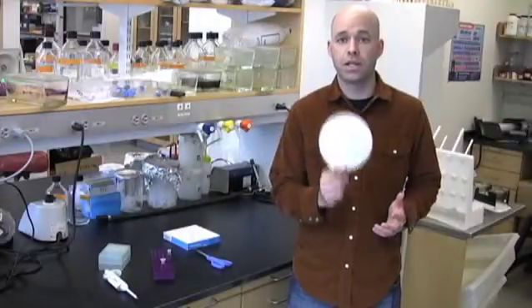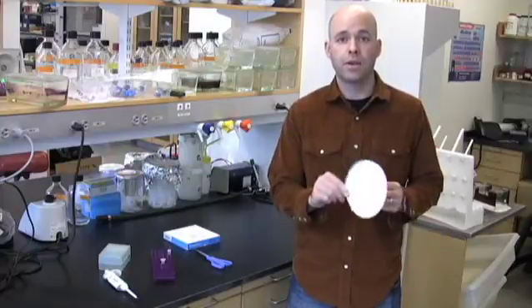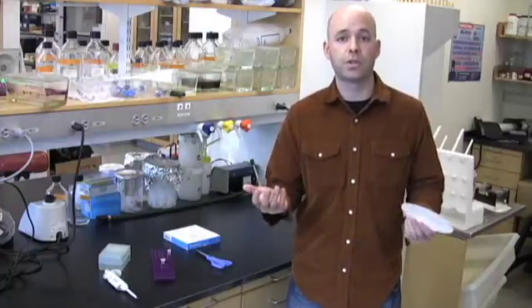A few days later your collaborator is going to get your filter paper in the mail, and they're going to need to now extract the DNA back for use in their own experiments.